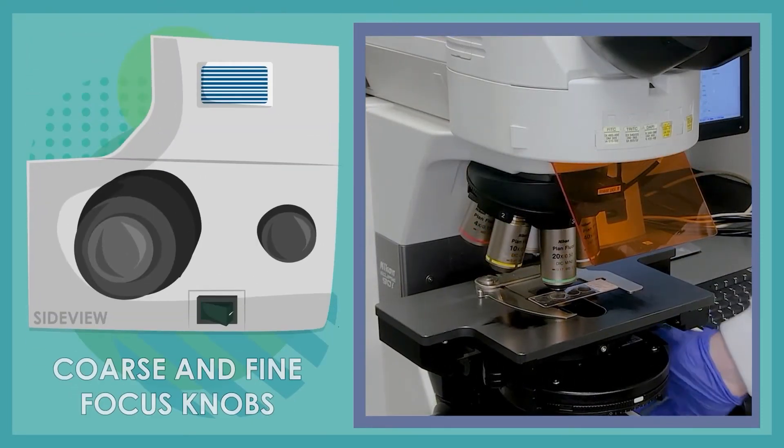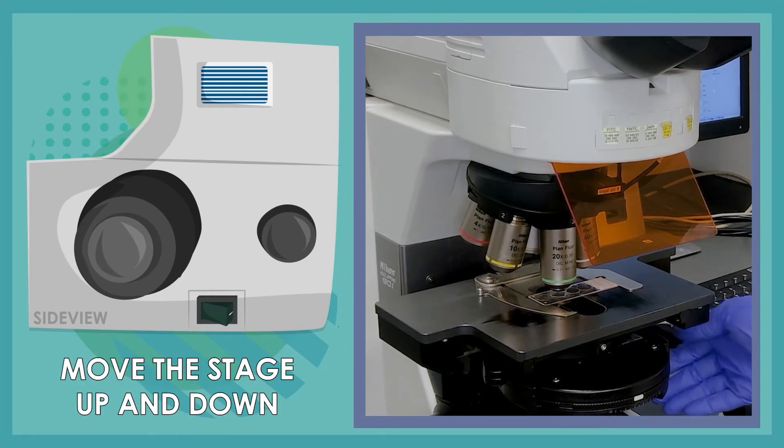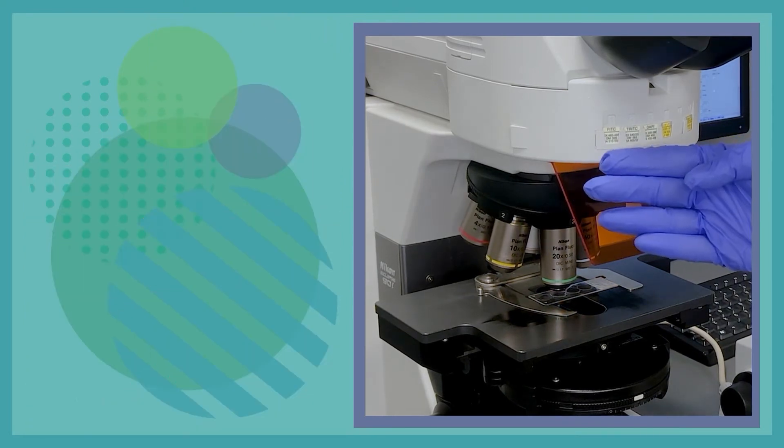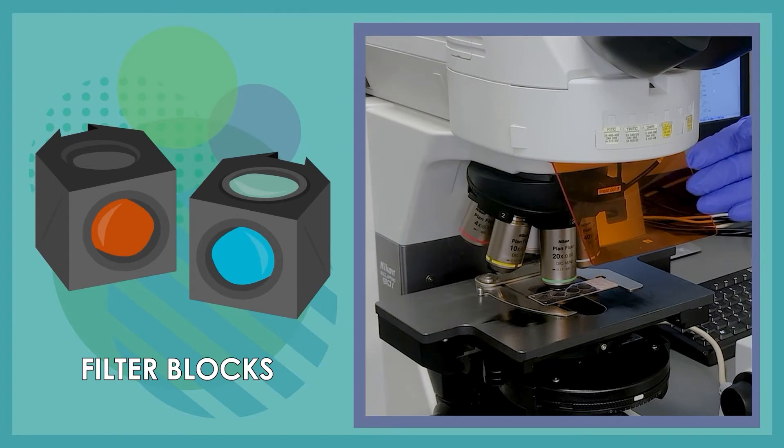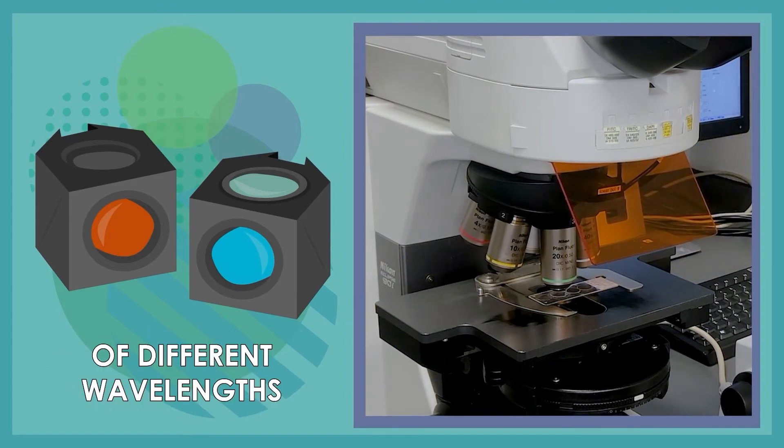Next we have the coarse and fine focus knobs that allow us to move the stage up and down to bring our sample in and out of focus. Within the microscope here we can also find filter blocks where we can use these filters to look at samples through different laser lines of different wavelengths.